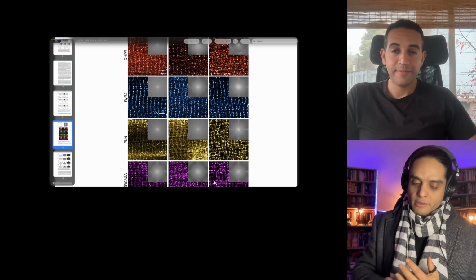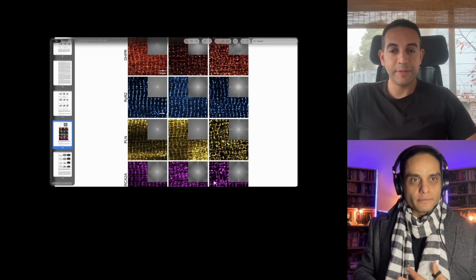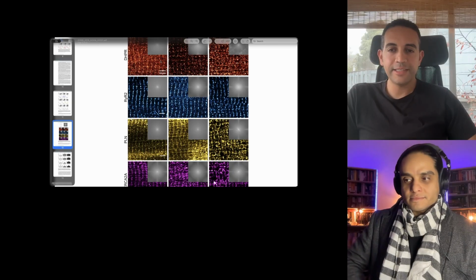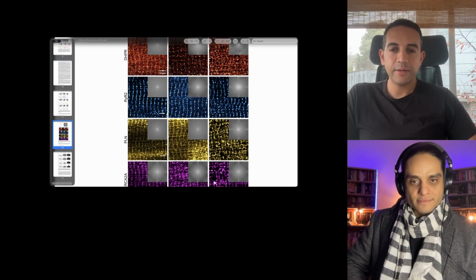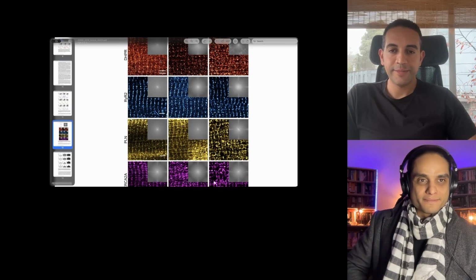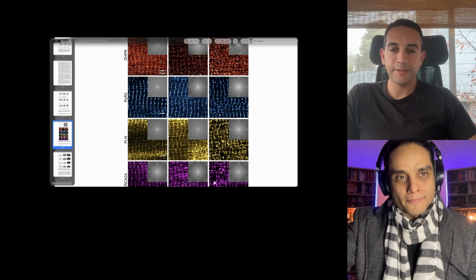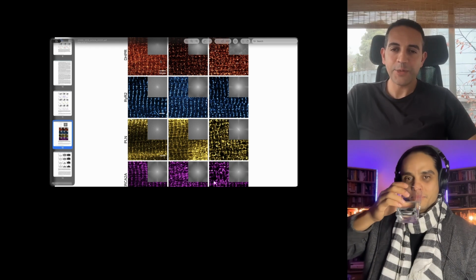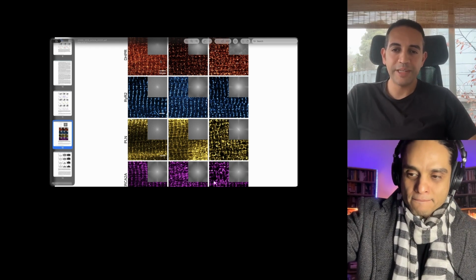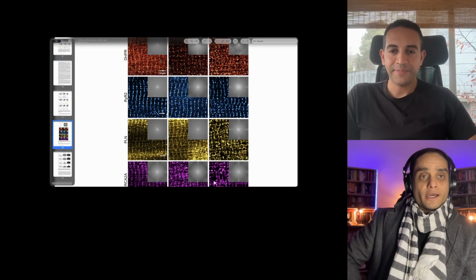But I'll tell you something very simple. Fixing a sample, and relying on PFA, paraformaldehyde, from last week, or permeabilizing buffer from 2 weeks ago, and wondering why things are not working. No, just make your buffers fresh.